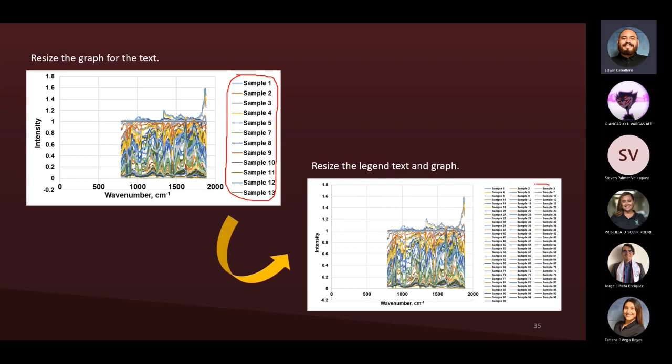Now, this looks ugly, right? Because it's a lot of legend. It's a lot of samples. Normally, you would have something that allows you to minimize that amount of legend. In this case, I'm placing it all so you see how you might manage it, okay? However, this is how I scaled it, and it looks a bit better than what we have here.